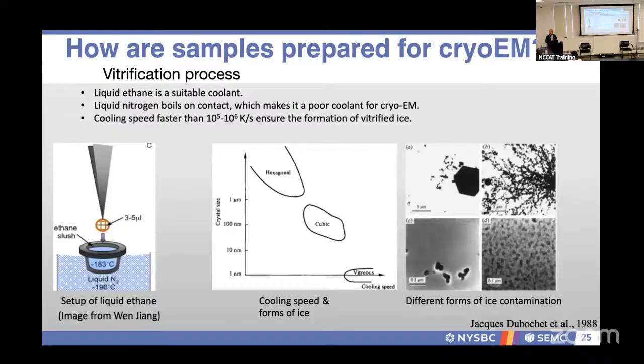So it's very much like a glass-like water where it's still sort of a liquid, but in terms of how we treat it, and though we call it ice, we don't really mean ice. We really mean vitrified water, this glassy-like amorphous water. And if we cool that fast, we cool so fast we don't form hydrogen bonds, and we don't add extra strain to it.